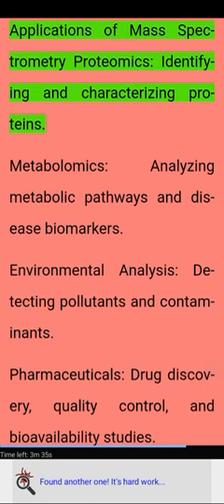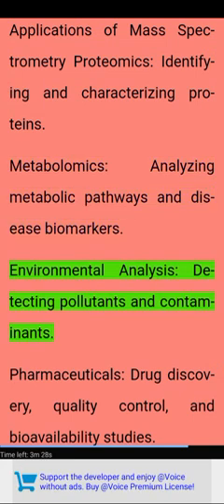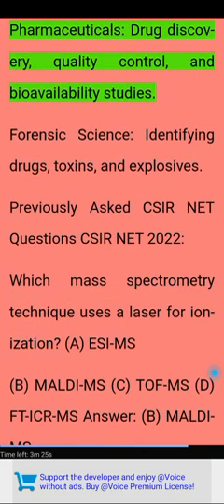Applications of mass spectrometry: proteomics, identifying and characterizing proteins. Metabolomics, analyzing metabolic pathways and disease biomarkers. Environmental analysis, detecting pollutants and contaminants. Pharmaceuticals, drug discovery, quality control, and bioavailability studies. Forensic science, identifying drugs, toxins, and explosives.